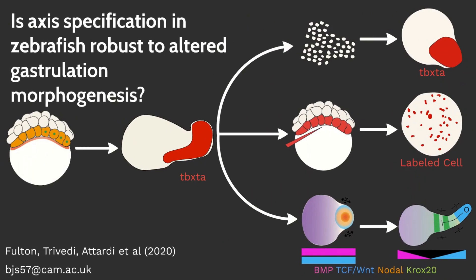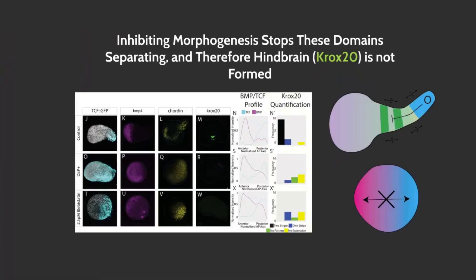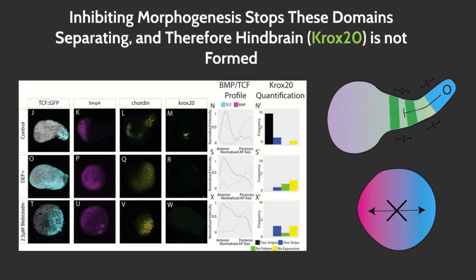We observe that in early pescoids prior to elongation, activity of two major signalling pathways, BMP and Wnt, are uniformly distributed across the pescoid, as shown here by stainings for BMP7 and a Wnt activity reporter. Over time, we observe that these two domains separate with BMP localised in the anterior and Wnt localised in the posterior. In between these two domains, we observe expression of the hindbrain marker Crox20, as can be seen on the top line.